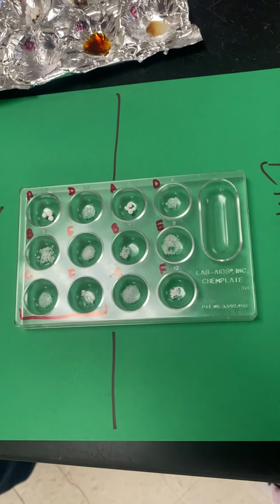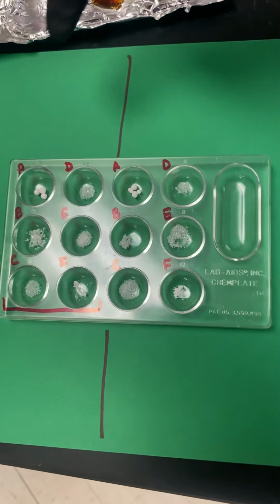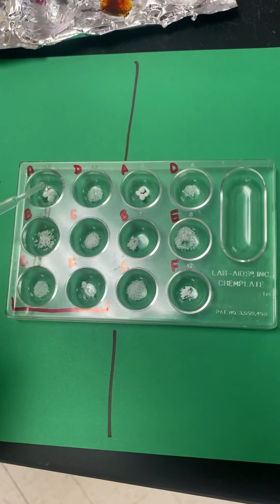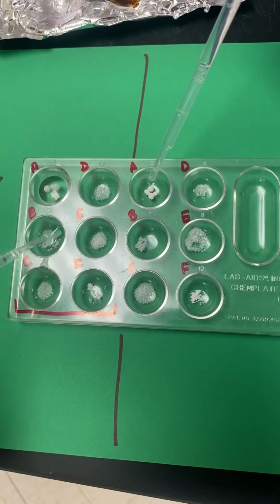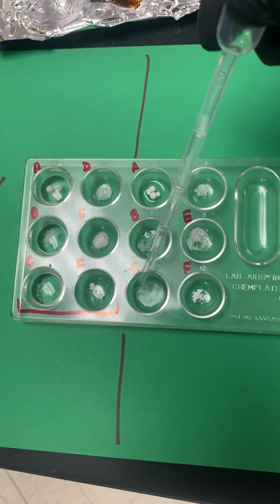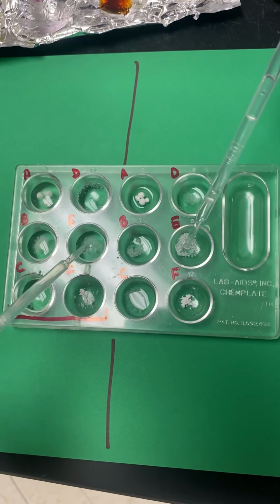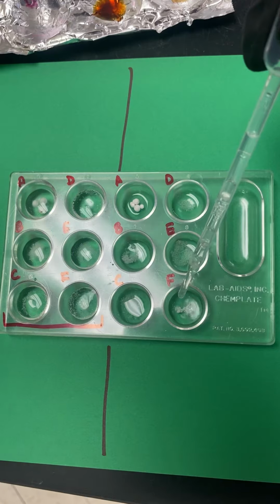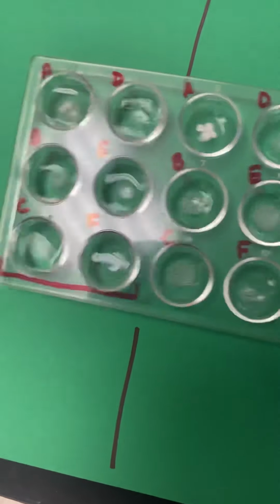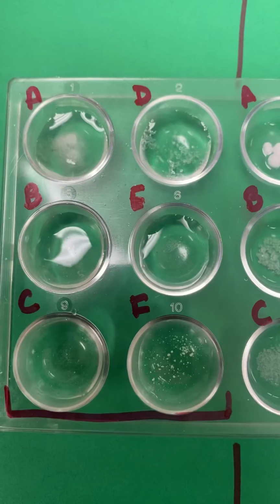So now we just distributed some of each one of our samples into a new well plate. We're going to add water over here to this A through F and ethanol over here to this A through F. And we're trying to see, do they dissolve? Shake it. I feel like it's getting cloudy around it.